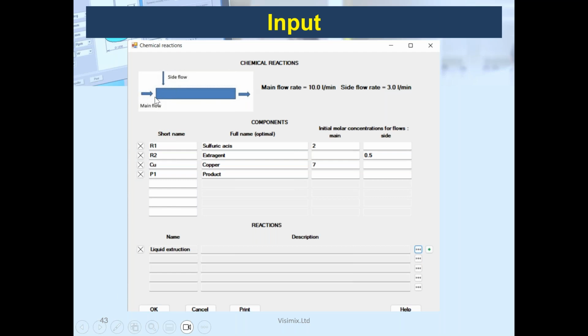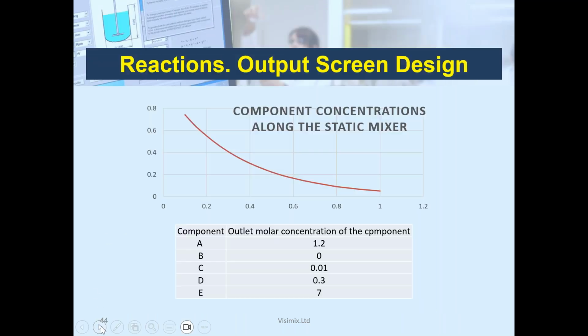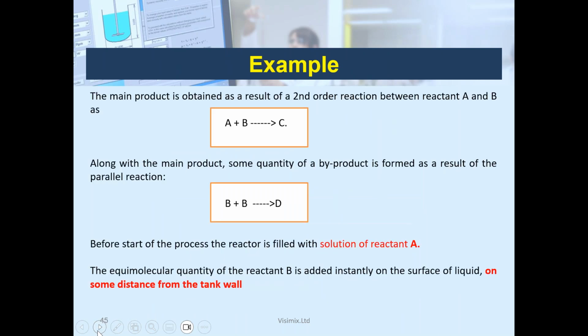What you can see here is now the implementation in flow chemistry that will happen in around 6 months from now or 9 months from now. And what you will get is the concentration as a function of the time or a function of the position, depending on the application. Okay, now what we will do, I will open the software that in this step is only a demo.